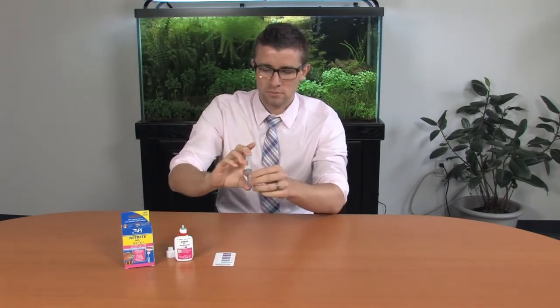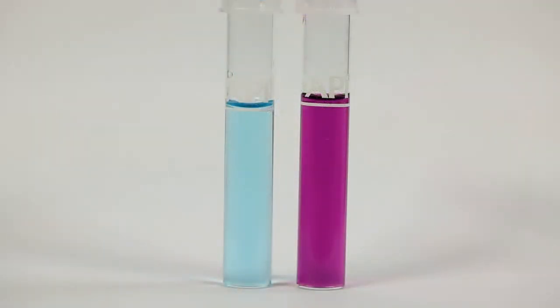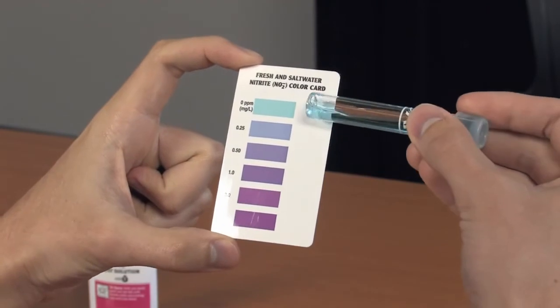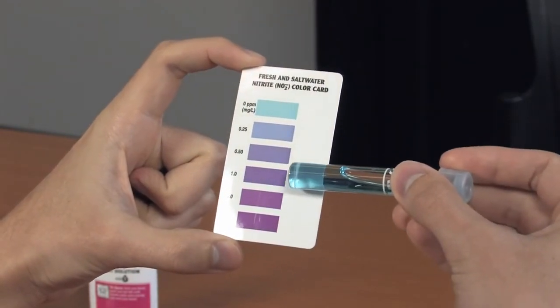Wait five minutes for color development. The test tube will change from pale blue to purple if nitrite is present. Compare the test tube to the color chart. The closest match indicates the nitrite level.